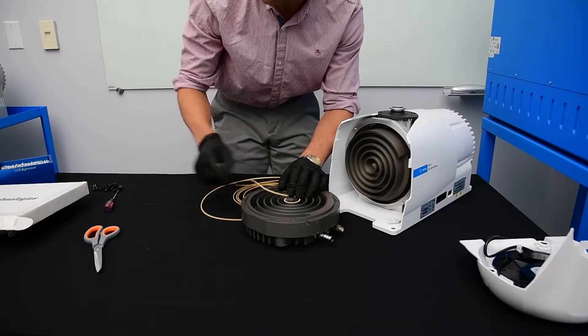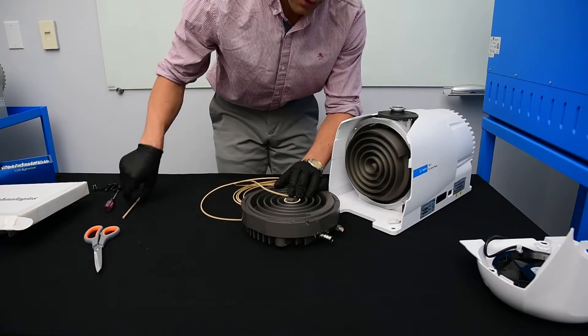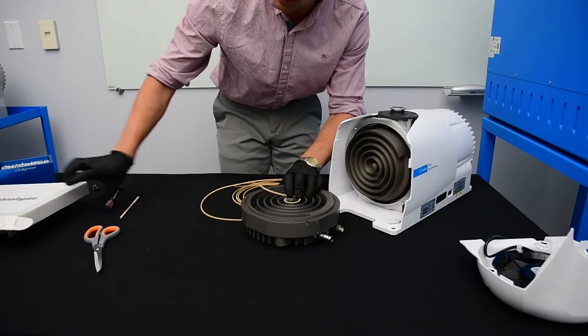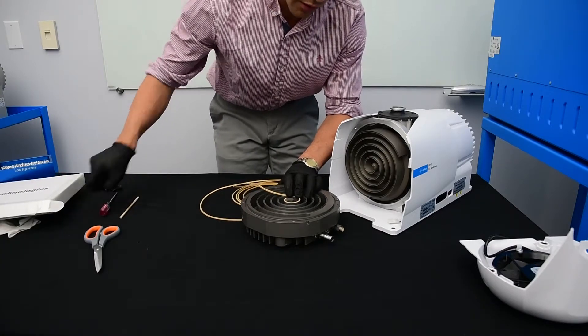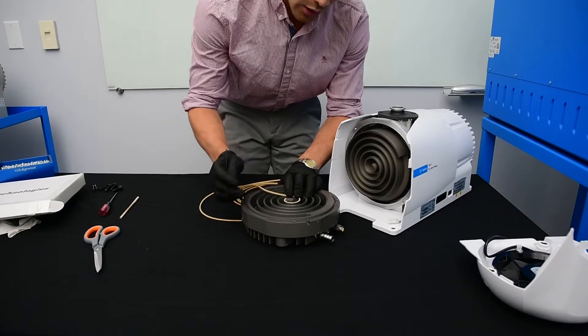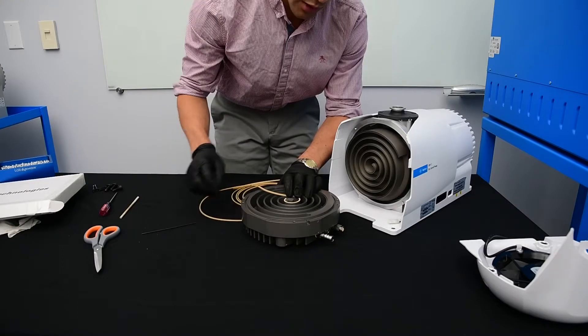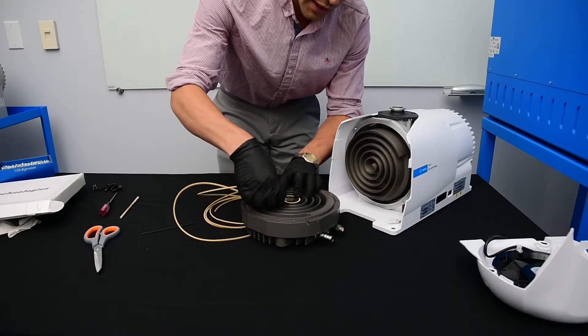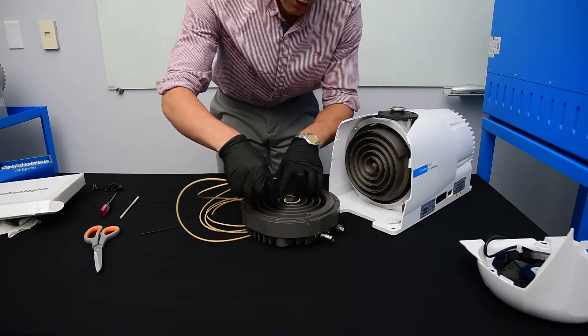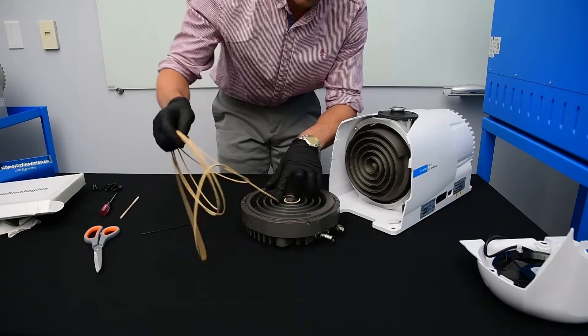As we work our way around, we're going to come across some small grooves right here. These small grooves hold the tip seal in place. When you get there, you're going to have to use a wooden dowel to help press the tip seal down into the channel.